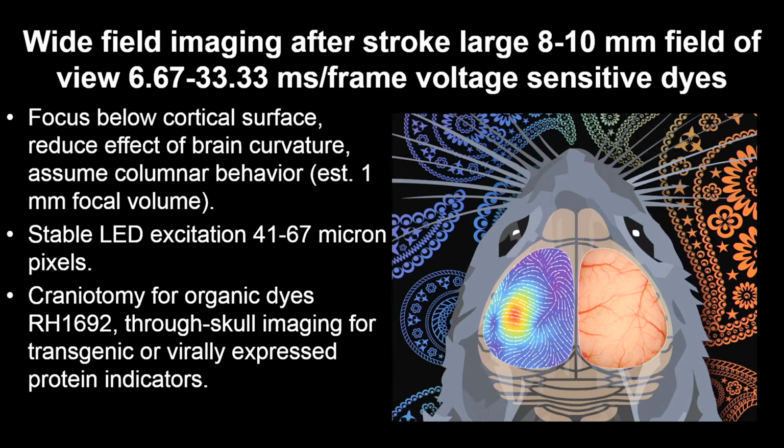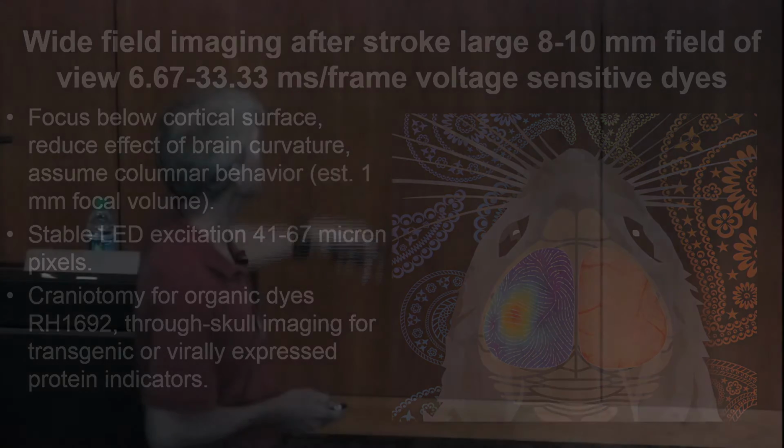So initially we did this with organic voltage-sensitive dyes, such as RH1692, which give you great temporal resolution, but they're only good for acute experiments.